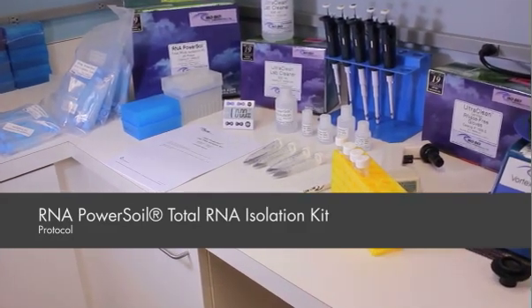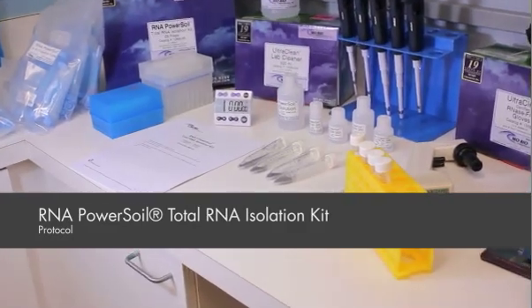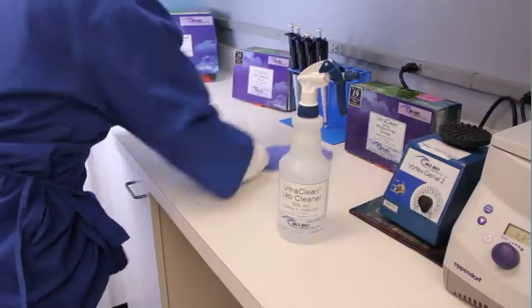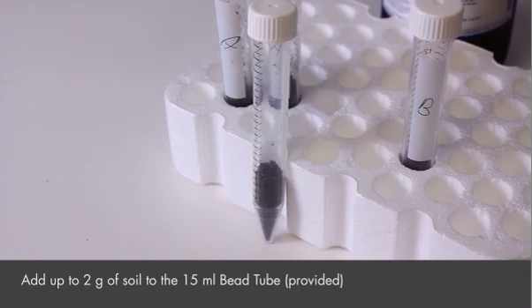This is a visual protocol for MoBio's Power Soil Total RNA Isolation Kit. Always work in a clean area to avoid contamination and RNA degradation. Add up to 2 grams of soil to the provided 15 ml bead tube.